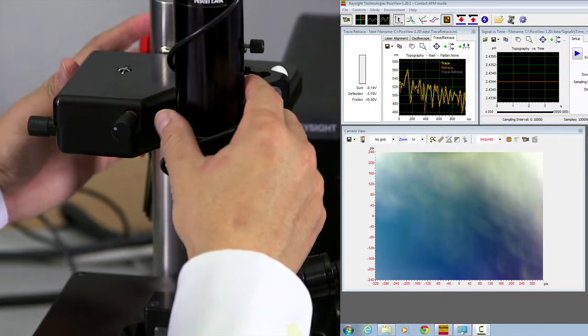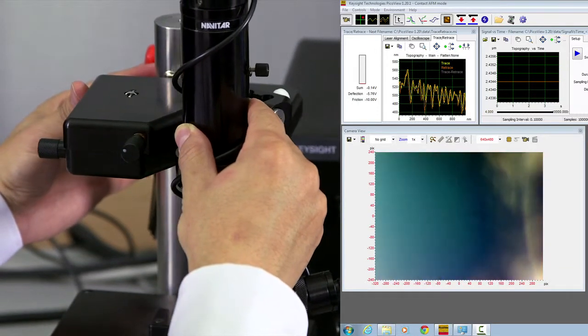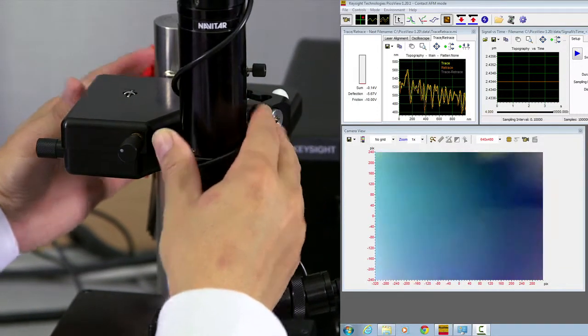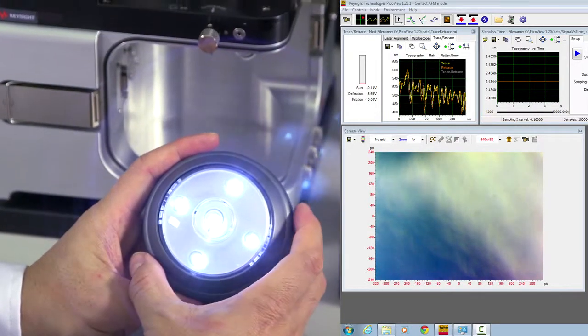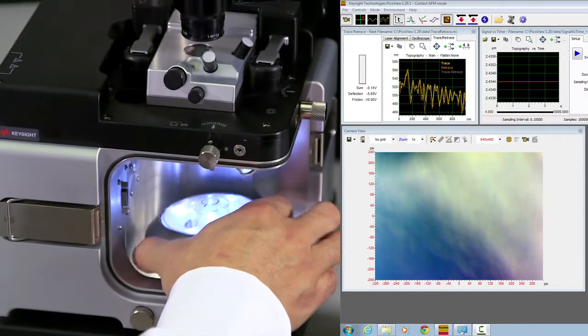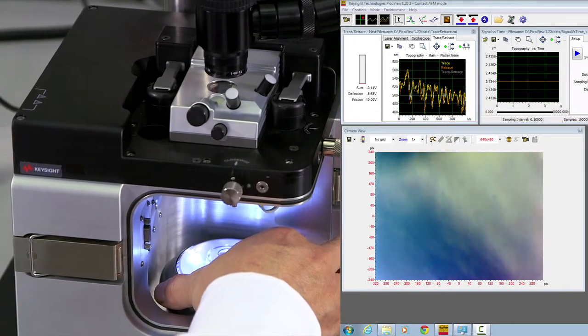You can rotate the optical microscope assembly itself. Make sure it can be rotatable. And then you turn on the LED light and put in the environment chamber to allow some transmission light through the scanner itself.